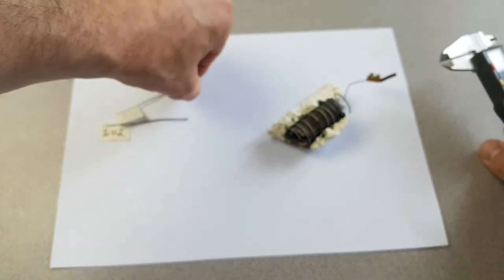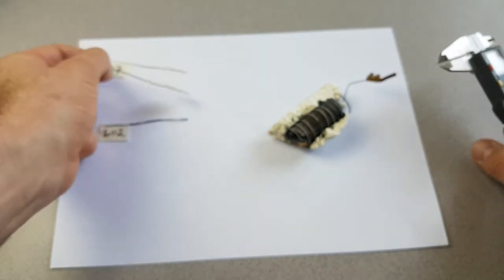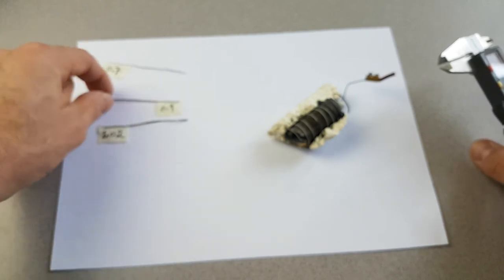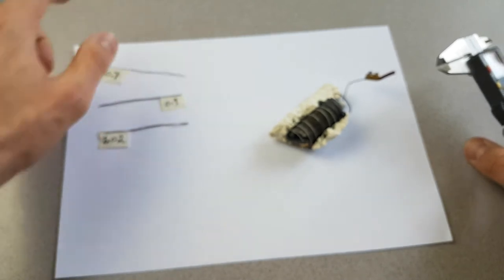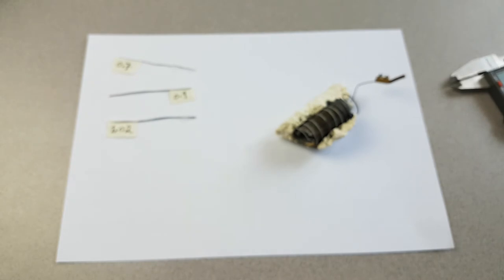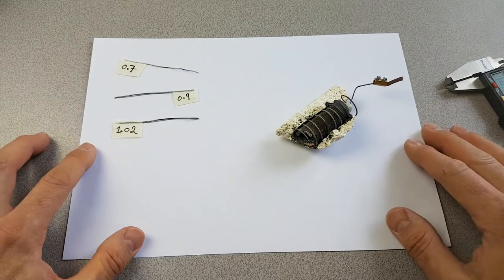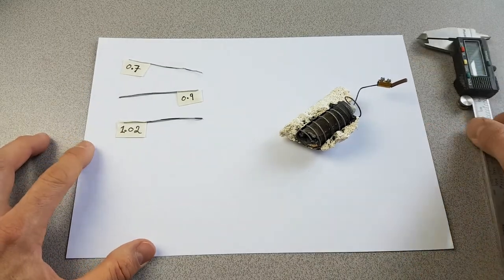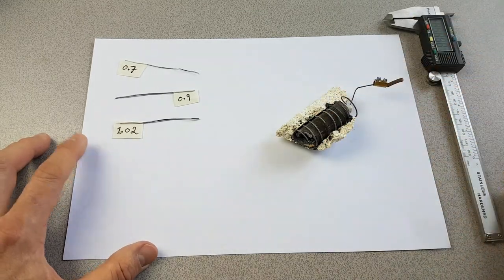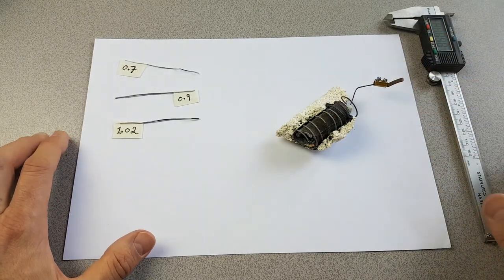I think we may use this wire. It might be prudent to test all of them if that's possible. What I'm asking the chemists out there is, what is the best acid preparation to conduct the materials analysis here?